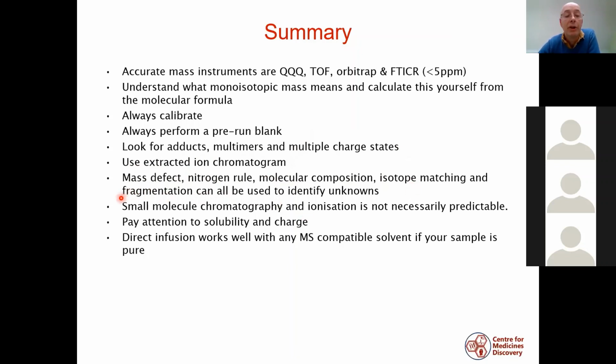So small molecule chromatography and ionization is not necessarily predictable because all small molecules are different. You need to pay particular attention to the solubility of your compound and also its charge. And as I've said, direct infusion can work quite well with any mass spec compatible solvent, provided your sample is pure.